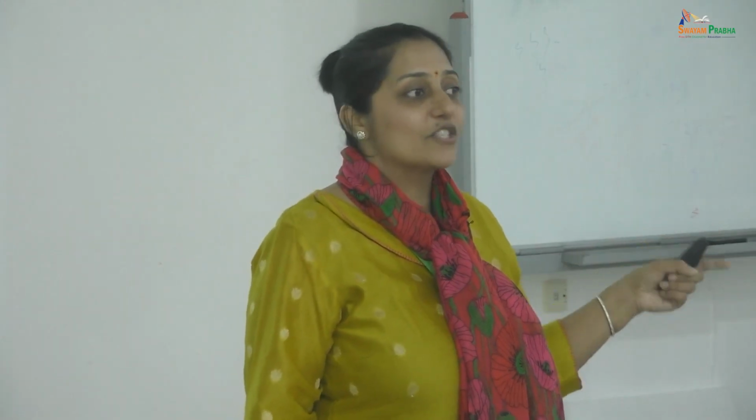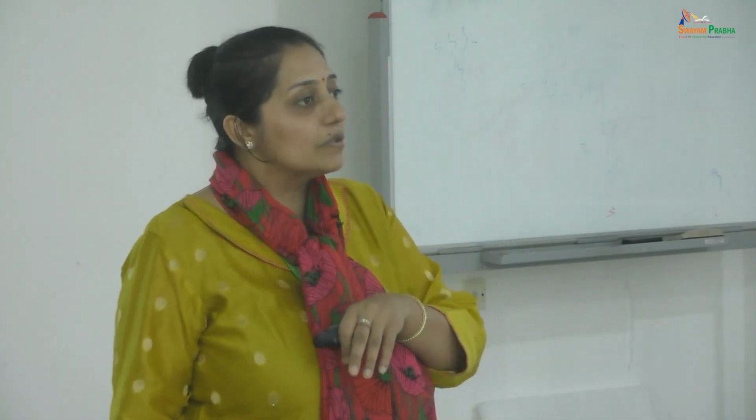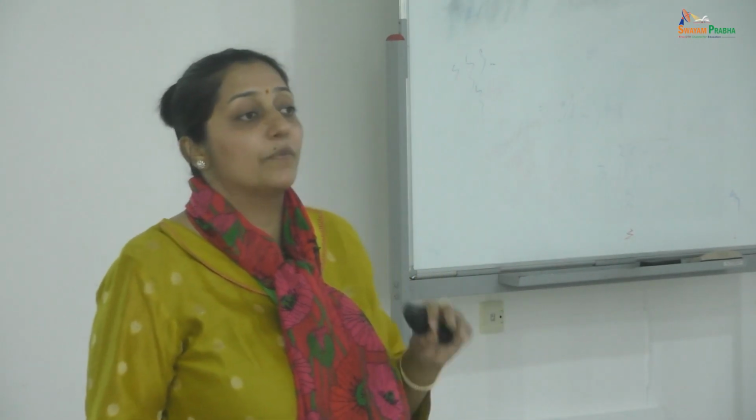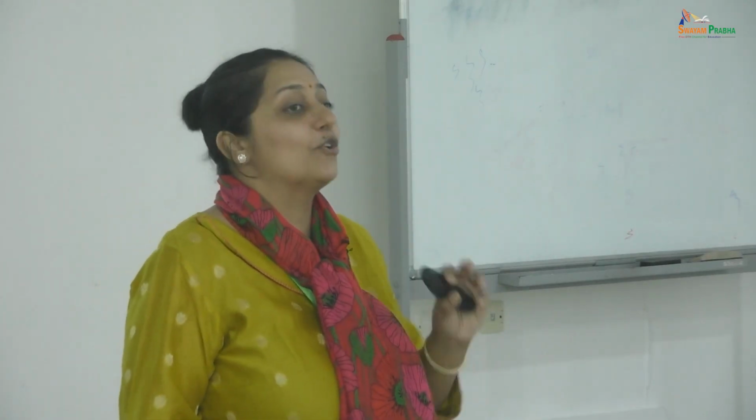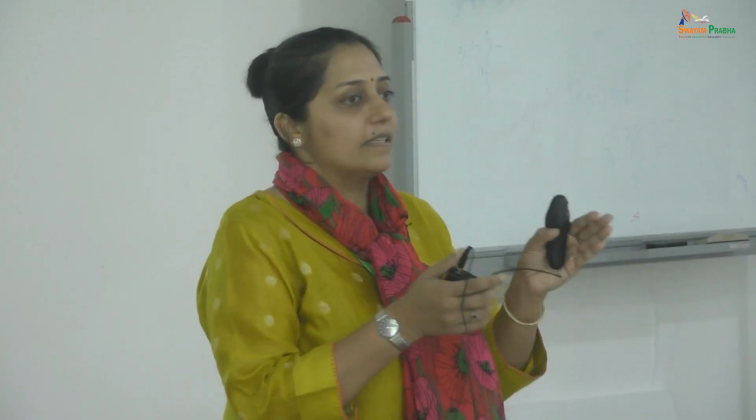So what is important? Before you have come to the reactor part, what were you doing? You were trying to establish the kinetics in the shake flask. You were trying to collect the data. You were trying to understand your culture requirements. So before you even come to the reactor, when you are establishing the kinetics, you must know in secondary metabolism whether it is growth associated, non-growth associated, or mixed growth associated, so that you can design, can I have the liberty of a two-stage cultivation? Maybe I need to have one reactor clubbed with another reactor design.